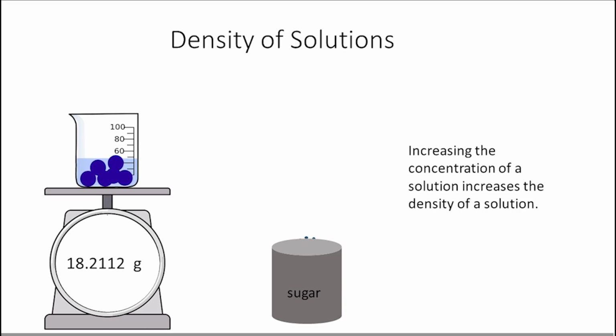For this experiment, you will determine the density of solutions of known sugar concentrations and construct a calibration curve from your data. Once you have determined the density of the soda, you will be able to calculate the concentration of sugar from the calibration curve.